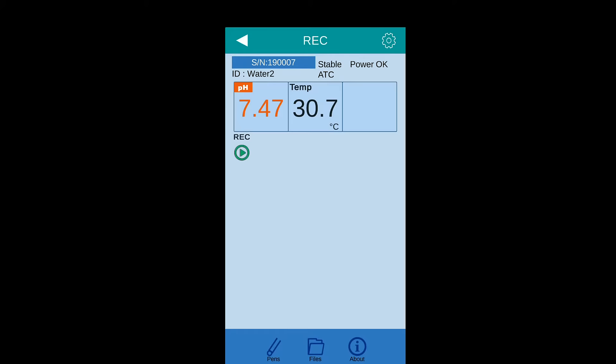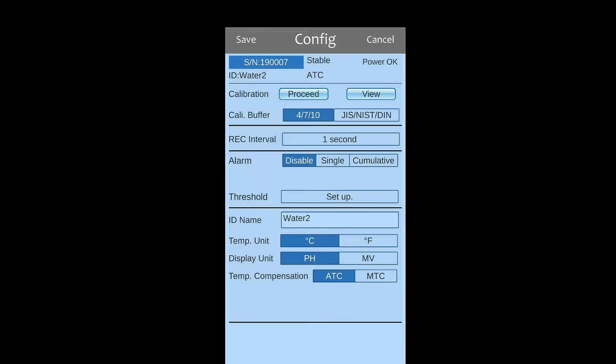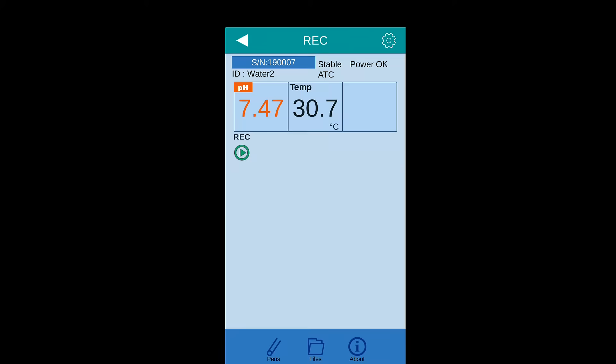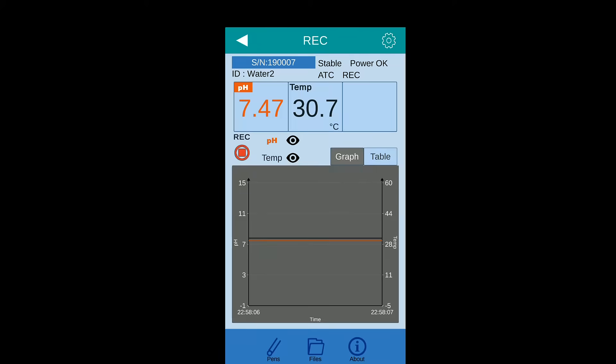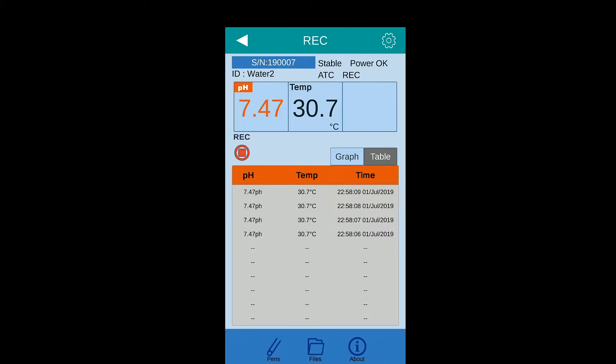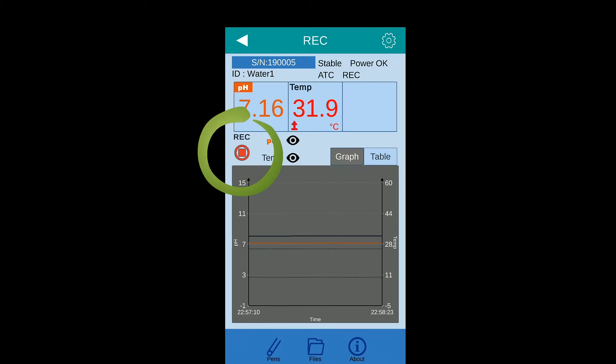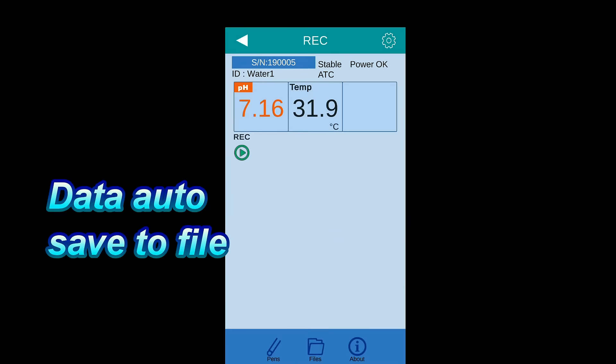While having multiple PH pens, you may repeat above to set up recording one by one. Press stop icon to finish recording. App will save the recorded data automatically.